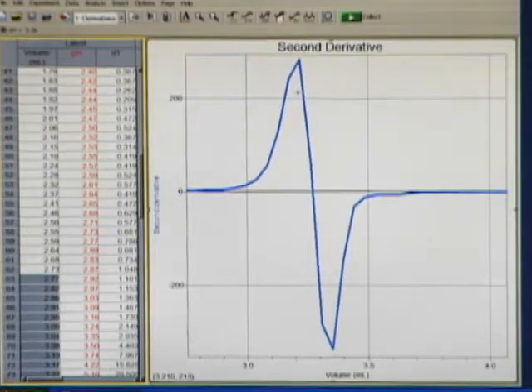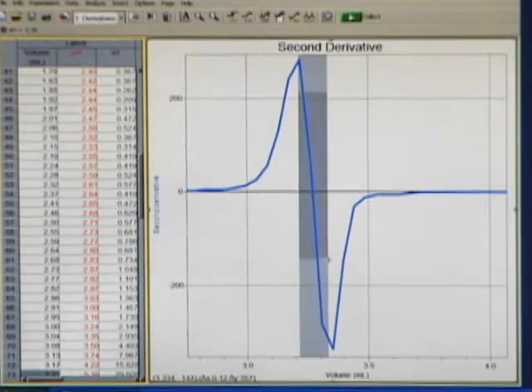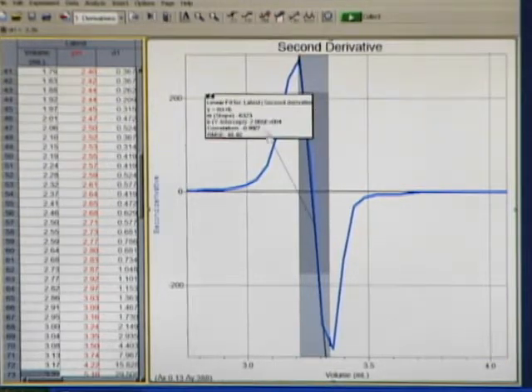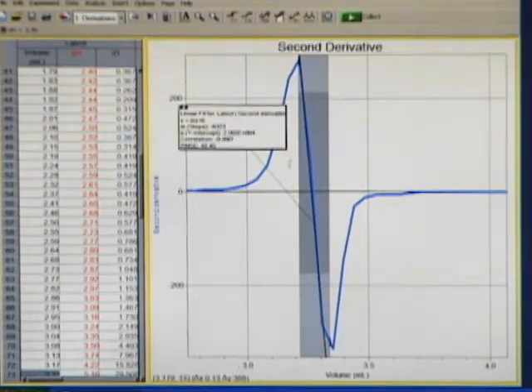If I select a region right about like that where it is a linear curve right along where it crosses zero, I can then click on the linear regression button on the toolbar, and it fits a line to that section.